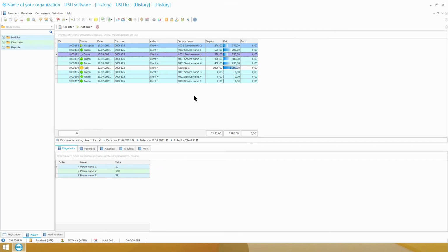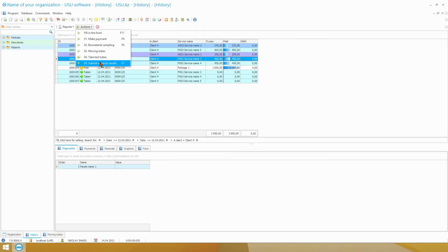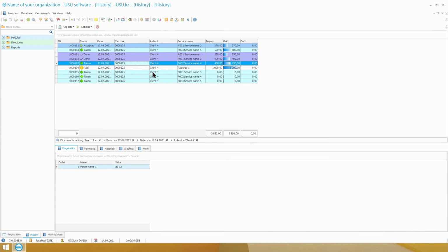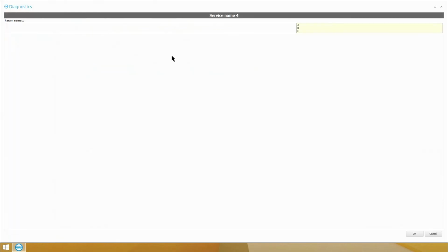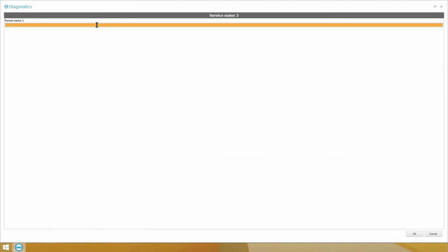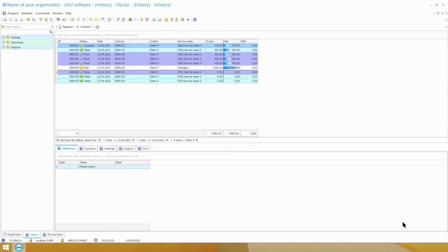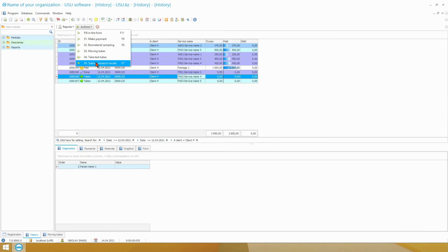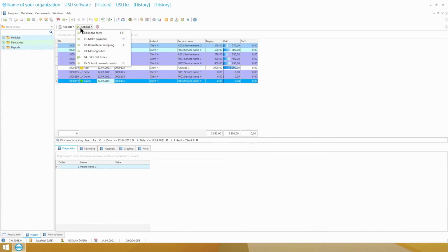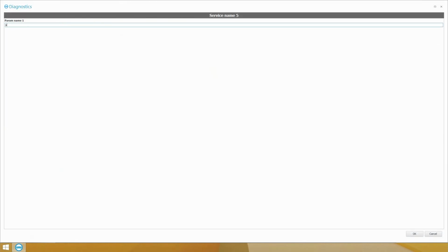Parameters can be number or line-oriented. With line-oriented parameters, you can enter any text, and you can use templates to quickly select the desired parameter from the list, rather than typing it from the keyboard. Moreover, the most frequently used values, which are considered to be the norm, can even be set up in advance, so that lab technicians work as quickly as possible and do not waste their time on selecting a value from a list.